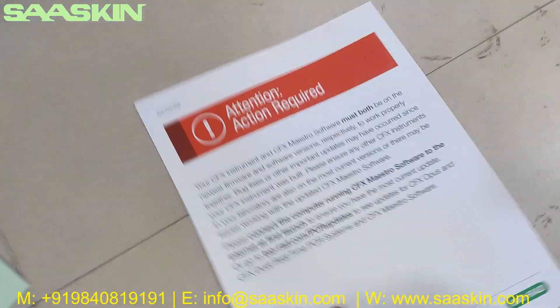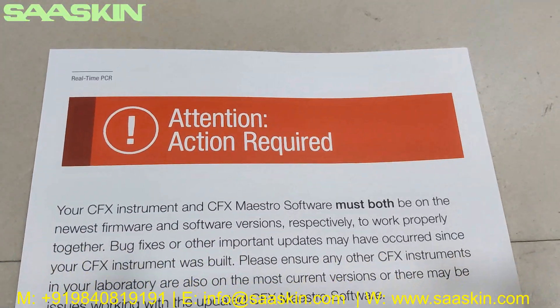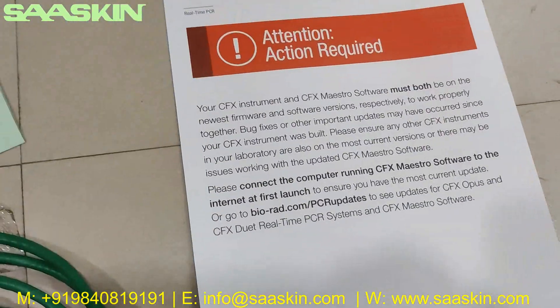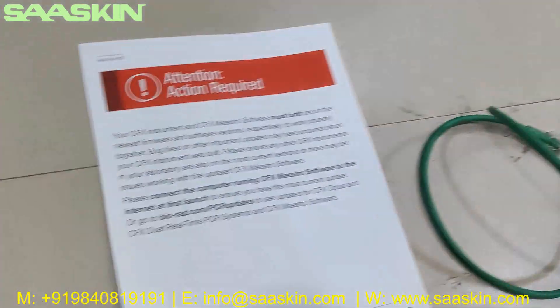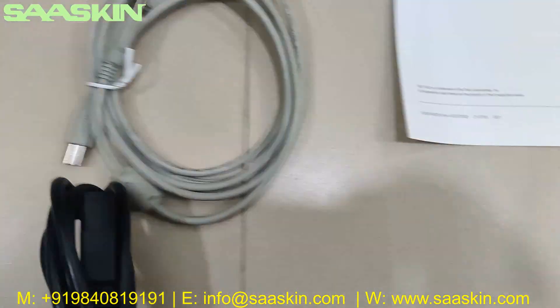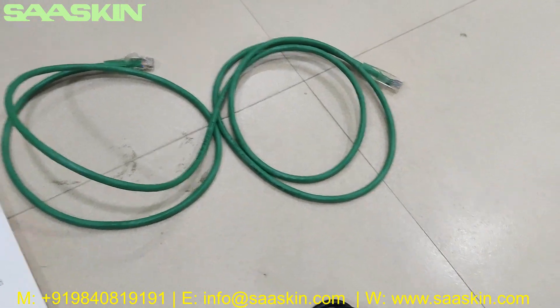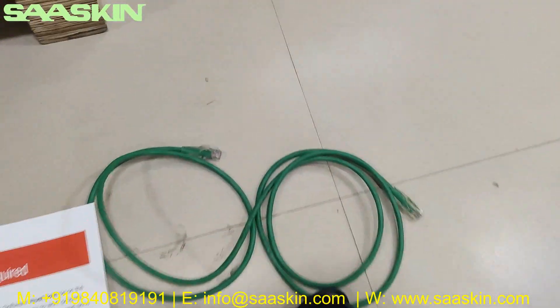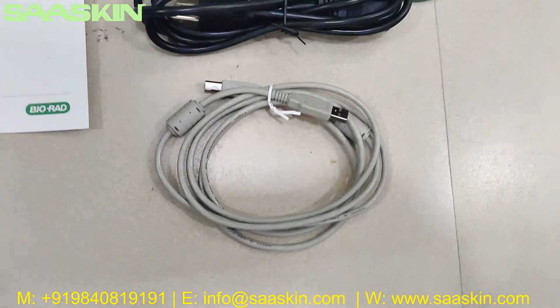Inside this pouch you can see there is an 'attention action required' instruction from Bio-Rad. There is a network cable, a system cable, and a power cord cable — three types of cables that come along with this package.